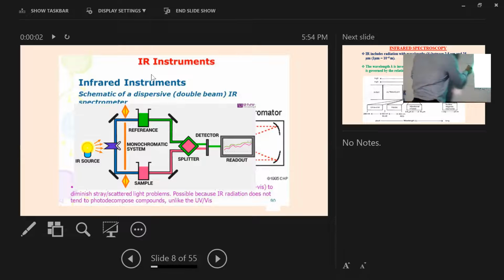Now, at a certain point where the water molecule absorbs, you will have that the intensity of this light decreases because it is absorbing some of the light. Therefore, you can consider the light intensity going this way will be reduced a little bit. Therefore, we can consider that the absorption intensity or the light intensity will be decreased.